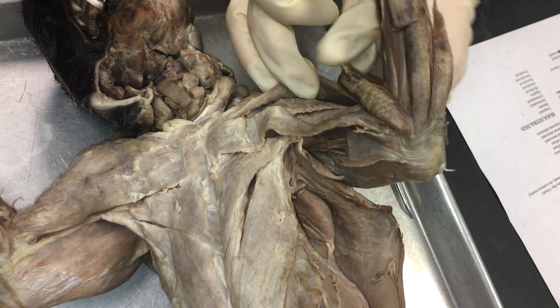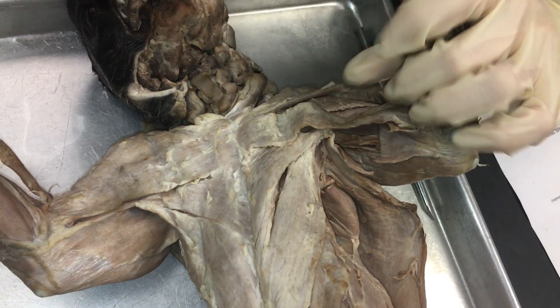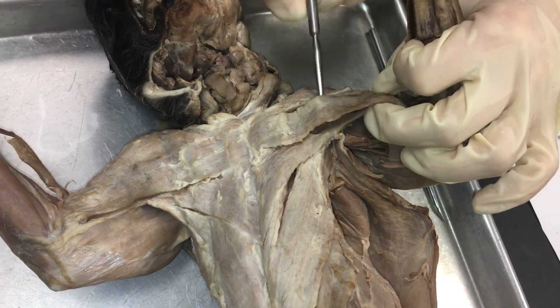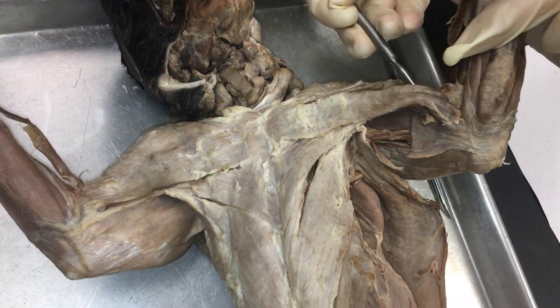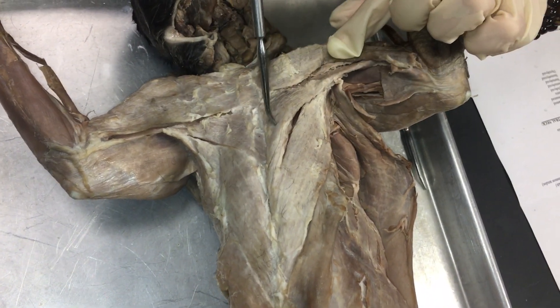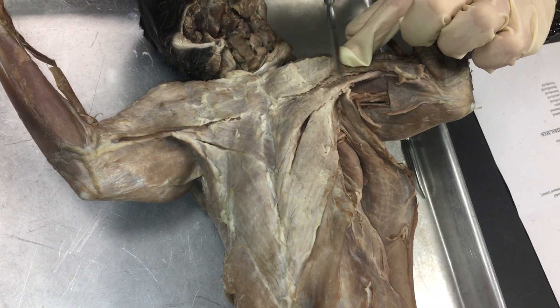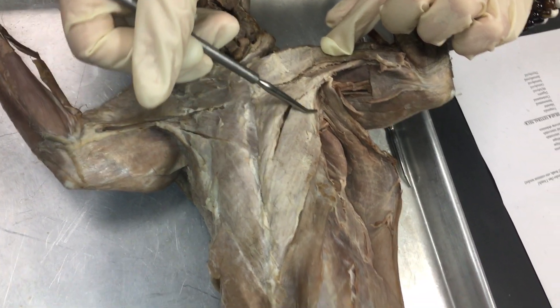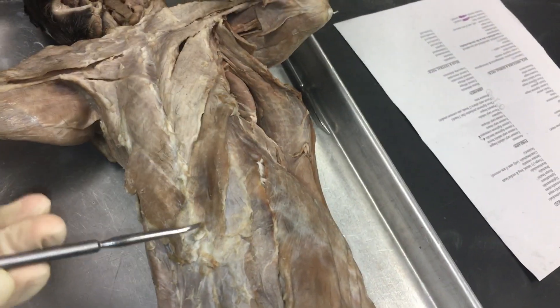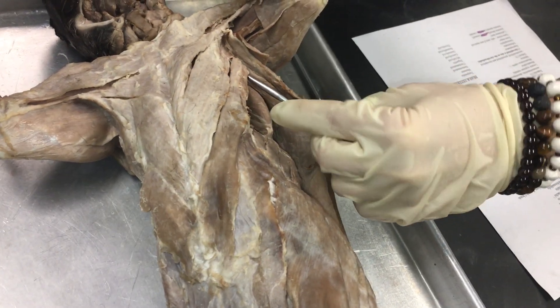We're going to move that out of the way just because that isn't on this particular section of your sheet. Moving down from here, we have pectoantibrachialis, pectoralis major, which is this whole muscle here, pectoralis minor, and xiphyhumeralis, which goes from the xiphoid process of the sternum up to the humerus.